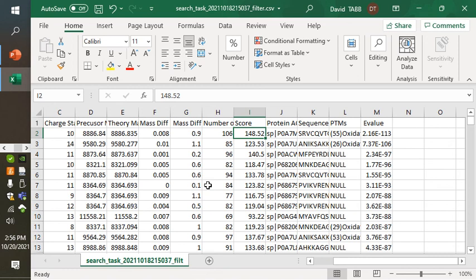How do you interpret the score? I think it's safe to say that we prefer a high score to a low score, but is a score from the top spectrum comparable to a score from an entirely different spectrum? No, I think that the authors would argue you shouldn't.